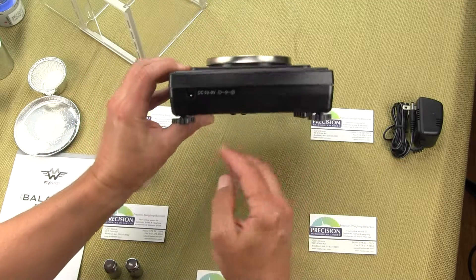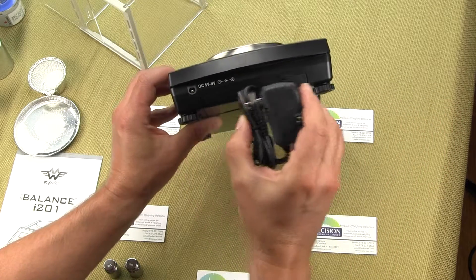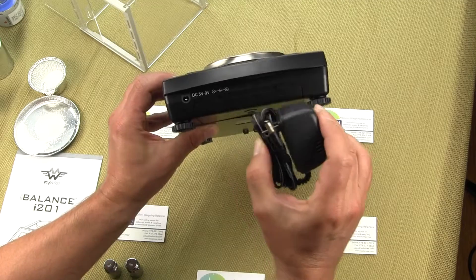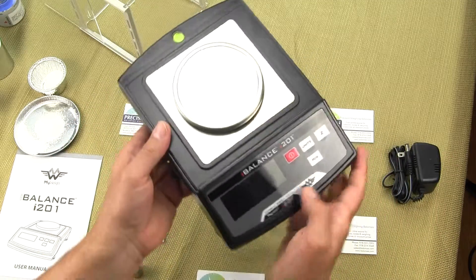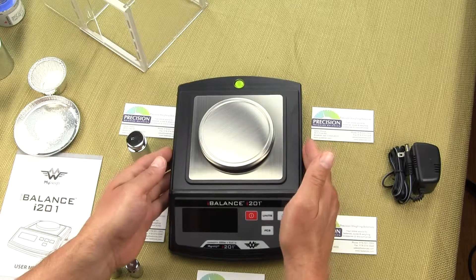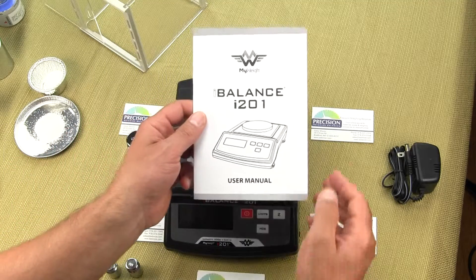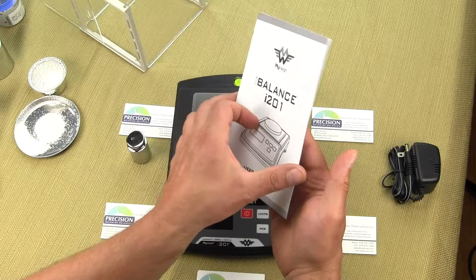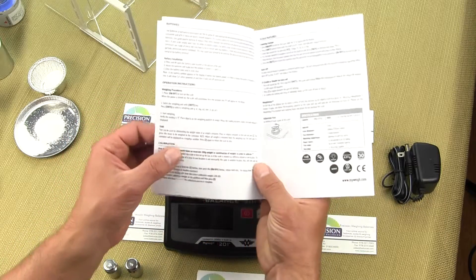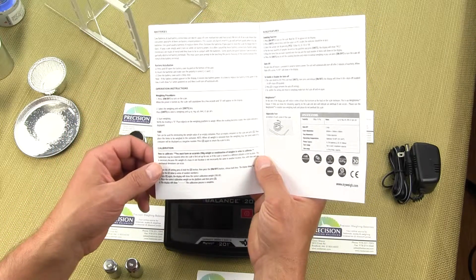Also on the back of the balance is the AC adapter port. The scale does come with the AC adapter included — most manufacturers make it optional, but MyWay includes it with the i-201. Also included with this balance is a 200 gram calibration weight, which is needed to calibrate the balance. You will also receive a detailed user manual explaining the scale's operation, all functions, how to configure the scale, what each keypad key does, and calibration.